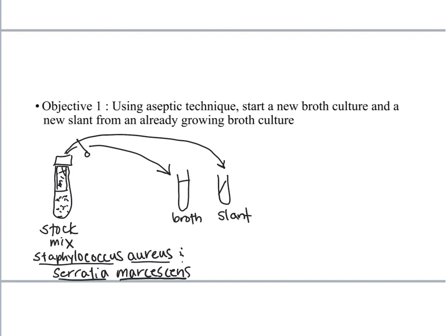Our first goal is to use aseptic technique. We're going to start a new broth culture and a new slant culture from an already growing broth culture. You will pick up a stock test tube and that stock is just going to be labeled mix. Remember the stock cultures, it's typed on a label and stuck on there.